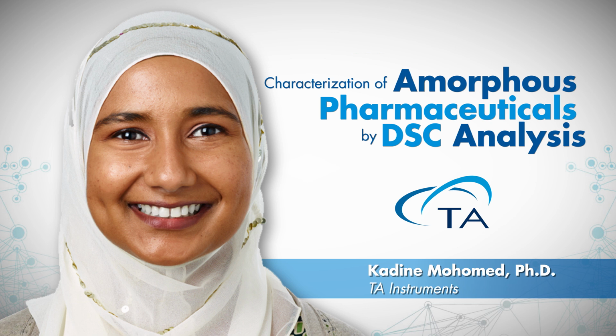There is an ASTM standard. I believe the number is E928, ASTM E928, which uses the DSC to characterize the impurity content of materials where your purity is at least 98.5%. What you're looking at is heating the material through the melt transition, and during this melt you have to confirm that the material is not decomposing, that it's not losing weight, and so on.